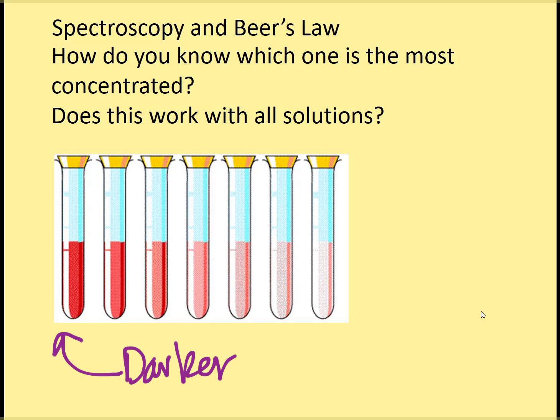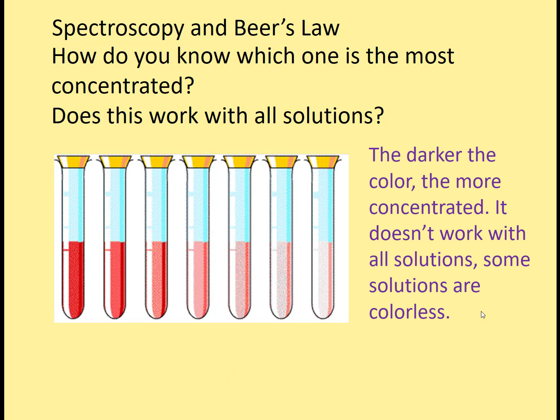Would this technique work with all solutions? And the answer is no. This only works for colored solutions. The darker the color, the more concentrated the solution is. If I had something that was clear and colorless like salt water, there'd be no way just to look at it to see if it was very concentrated or just mildly concentrated. I would have to do more chemical testing.